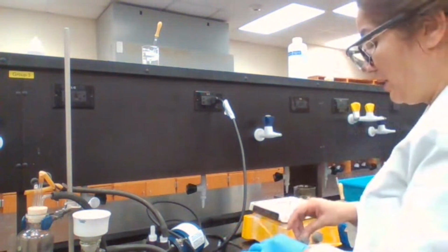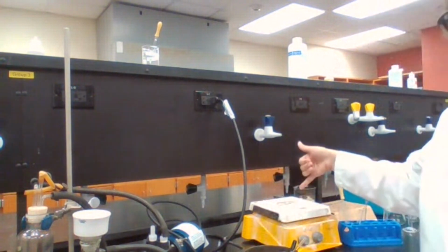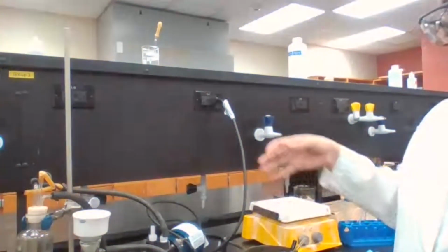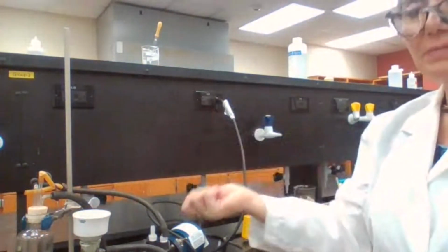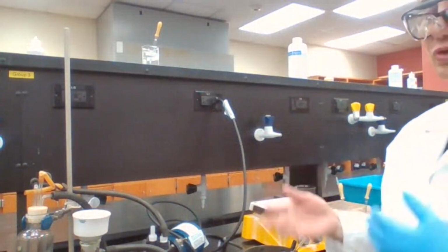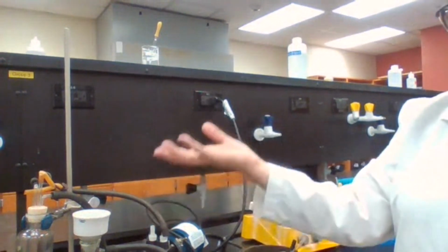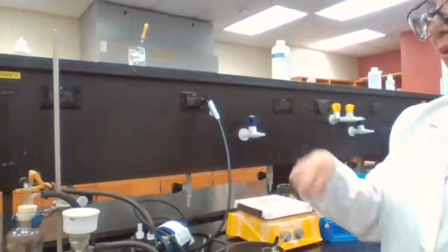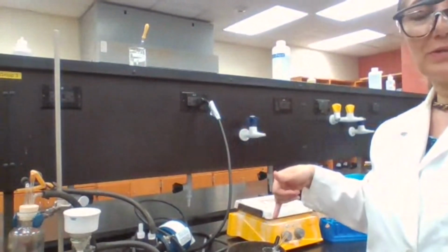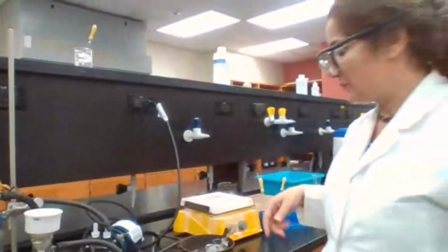Cold methanol. You remember when I put the sample on a hot plate in hot methanol, it dissolved? If I use room temperature, it can dissolve some of the precipitate, or the crystals. So I'm trying to avoid dissolving any crystals while I'm doing filtration. So for washing, the last step, I should use cold methanol or cold solvent in general instead of room temperature or hot.